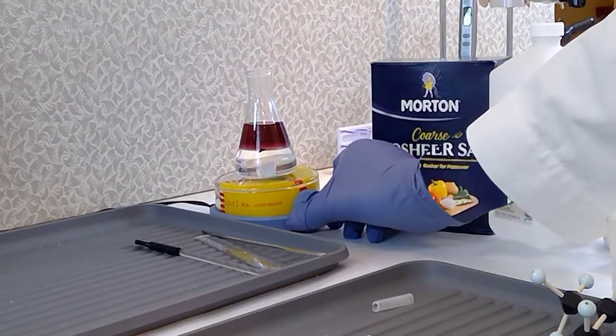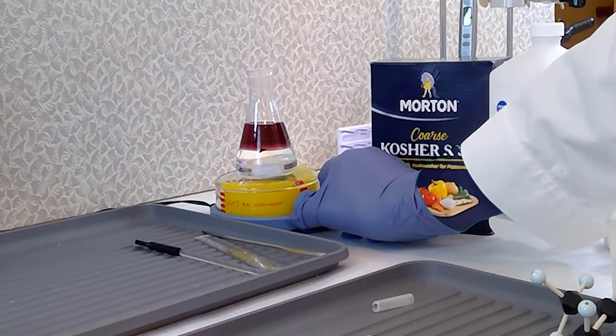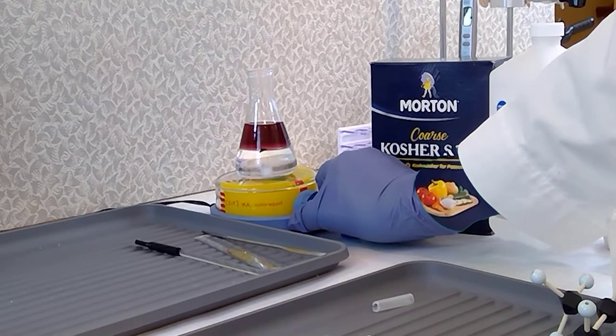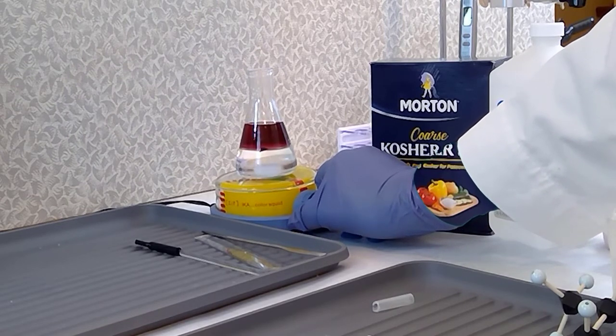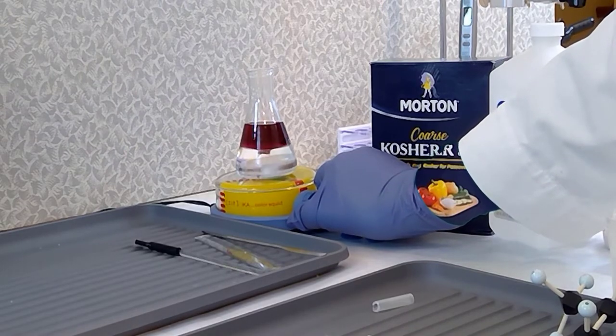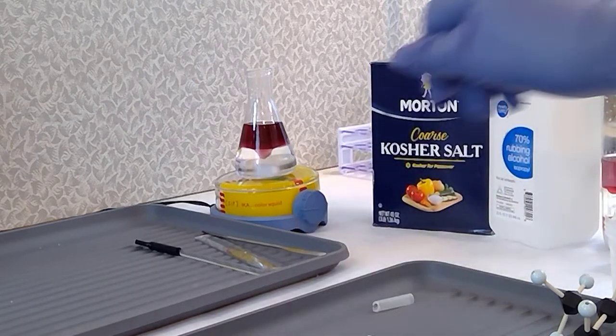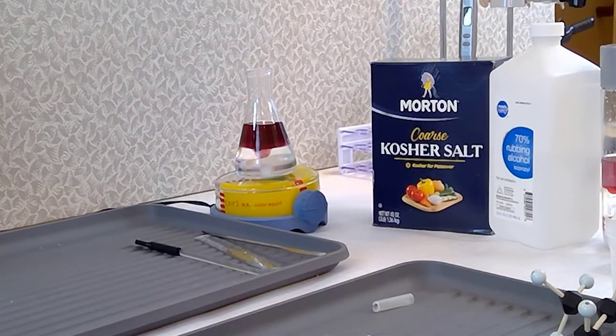There we go. And I've got my stir bar. And we're going to do a little bit of spinning. And we'll get that little vortex going. And we're going to pull in some of that isopropyl. There we go.